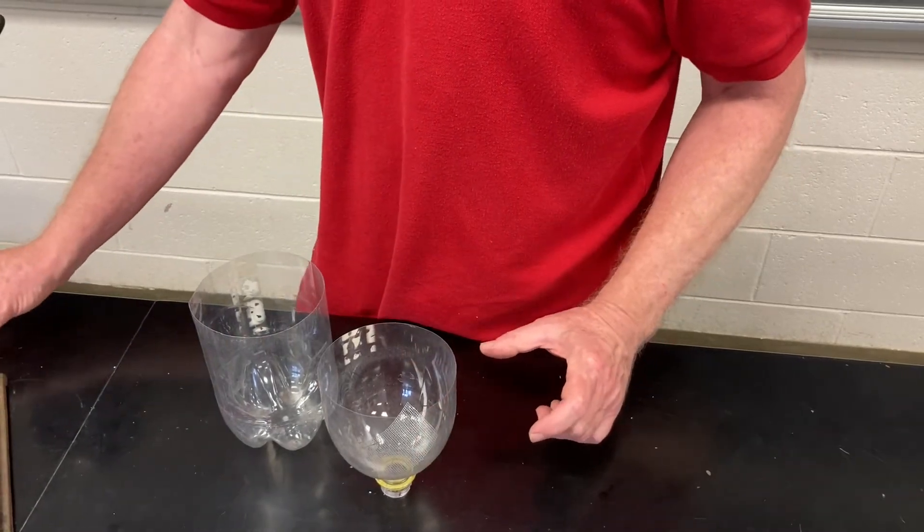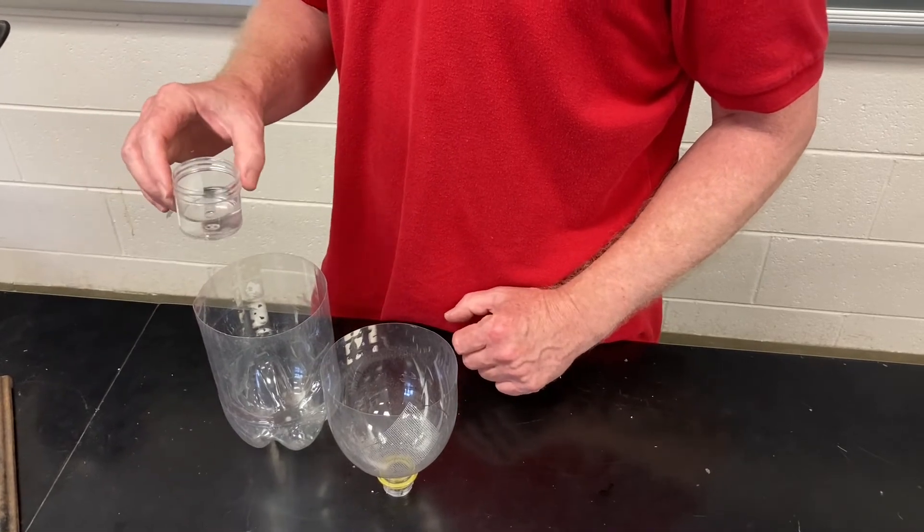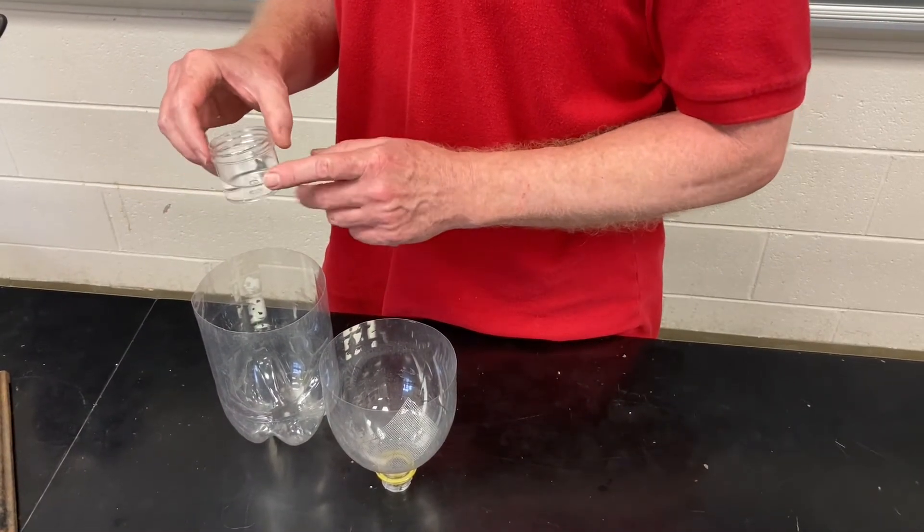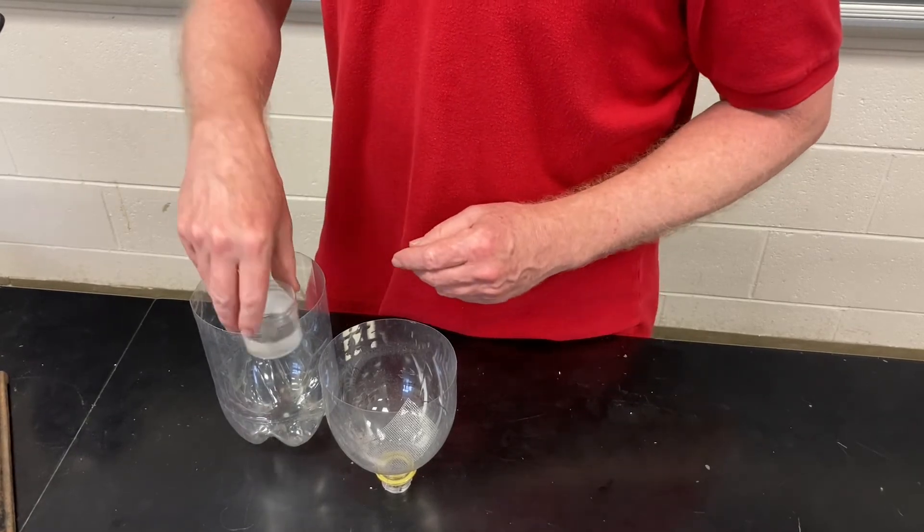The next thing you're going to need is some solution to preserve the arthropods you're going to catch. So this is 70% ethanol. I'm going to put it into the bottom here.